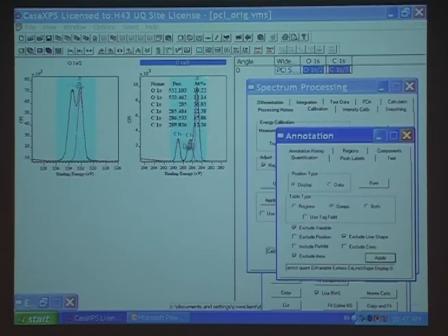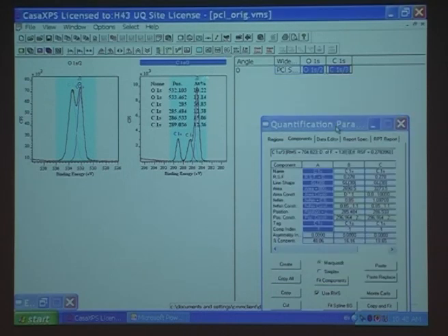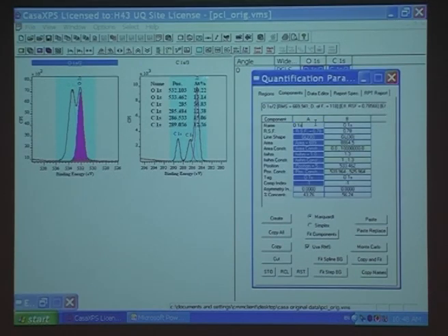Here they all are. I can rename them now. So I'm looking here. We've got one oxygen at 532.1. If you looked at a table, that will be the oxygen. I'm closing that off at the moment. Closing that. Coming into here to oxygen. And I'm going to call this, this is the oxygen doubly bound to the carbon.